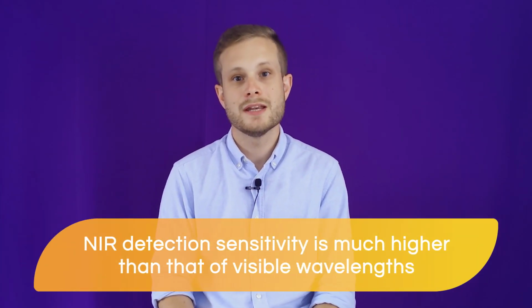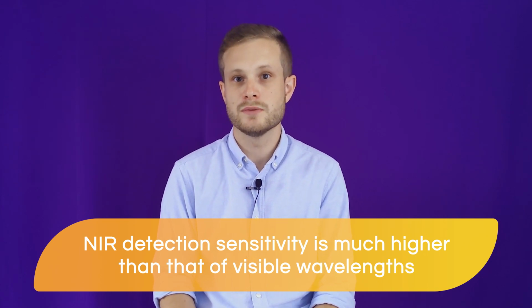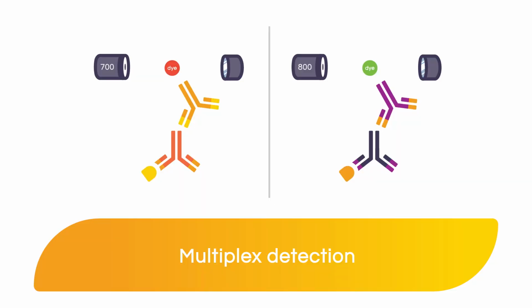Generally speaking, using appropriate detection hardware, near-infrared fluorescent detection sensitivity is much higher than can be achieved with visible wavelengths, and is comparable to that which can be achieved using chemiluminescent detection. Although there aren't as many fluorophores to choose from as there are for visible wavelengths, it is still possible to use two dyes, typically one at 700 nanometers and the other around 800 nanometers, to multiplex the detection in the near-infrared range, while still yielding high signal-to-noise ratios for both of the targets.